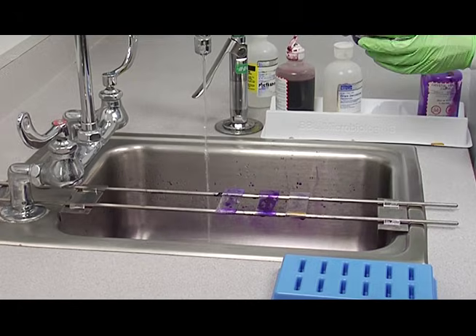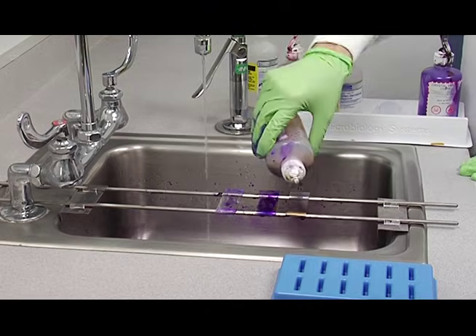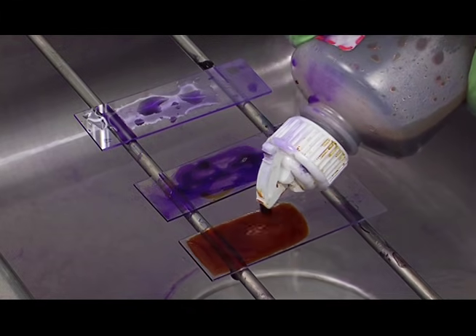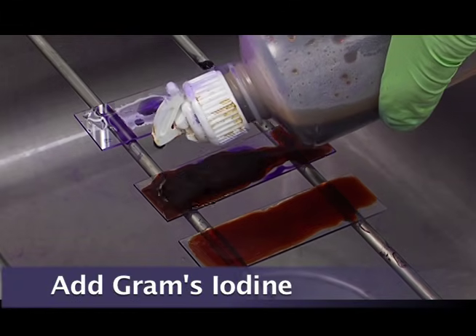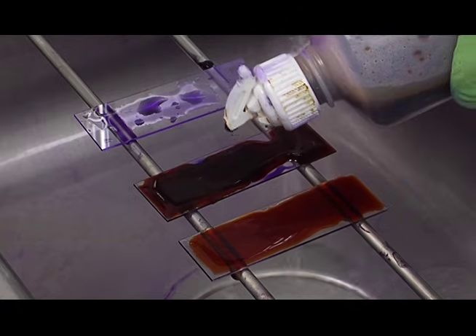Now we're going to add the Gram's iodine. And this fixes the crystal violet in the cells.